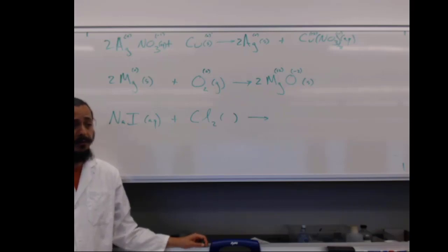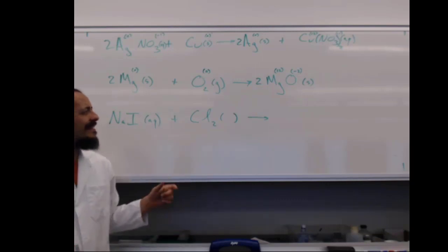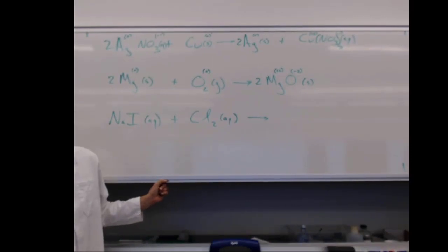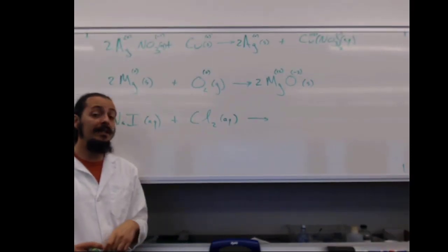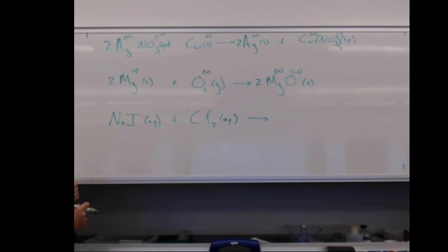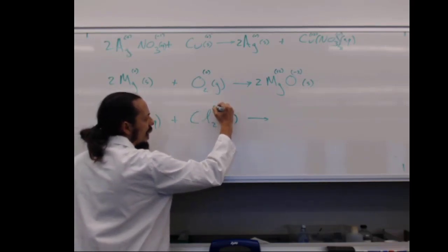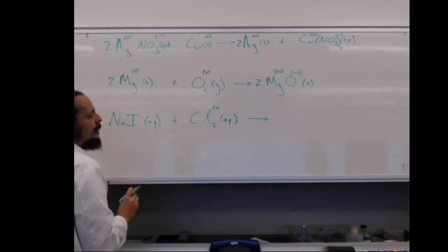Yeah, pools have chlorine in them. They don't like to have chlorine in them. That's why you can smell the chlorine. But under the right conditions, higher pressures, lower temperatures, things like that, we can force chlorine to be aqueous for a little bit of time. And that's going to allow us to make this reaction happen. Again, redox reaction. That chlorine, diatomic gas, so Cl2, is going to be in its pure state.